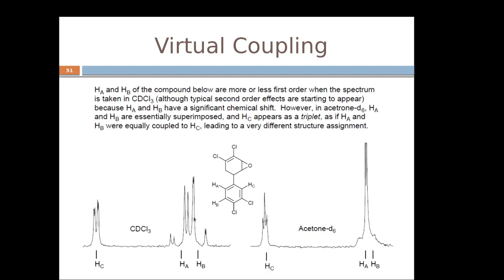And once the NMR spectrum of the same compound is measured in deuterated acetone solvent, you can see that the NMR peaks of both A and B nucleus come close together, coalesce or merge with each other, forming a single peak pattern. That means A and B nucleus become more isochronous. As a result, the NMR peaks of the proton nucleus come close together and the central peaks merge with each other, forming a triplet type pattern.